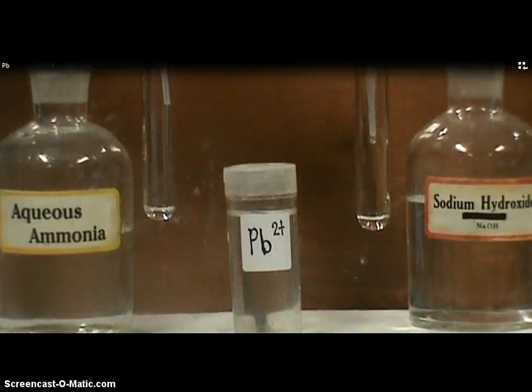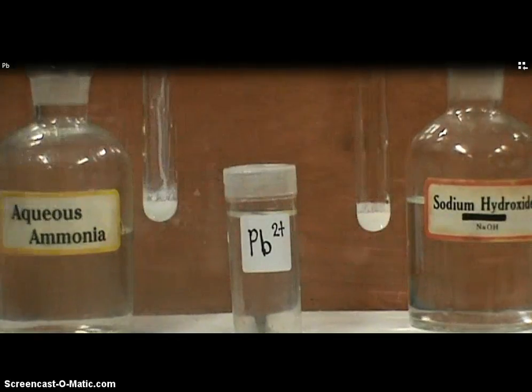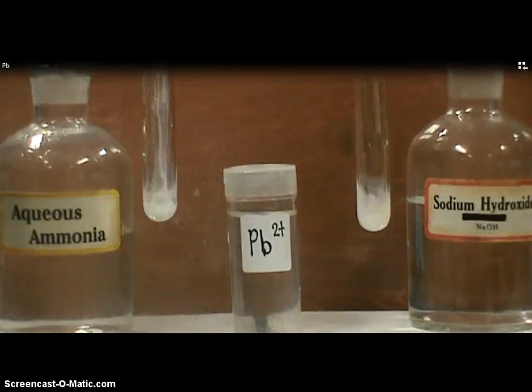Next, let us examine the lead-2 ions. When a few drops of aqueous ammonia and aqueous sodium hydroxide are added to the solution containing lead-2 ion, a white precipitate is formed. The white precipitate has a powdery texture.